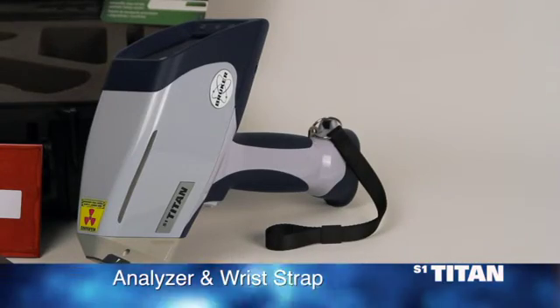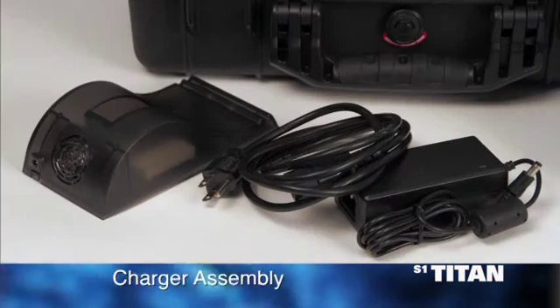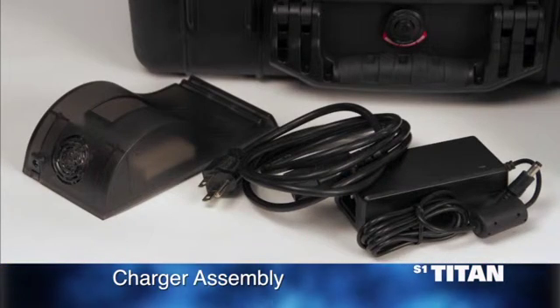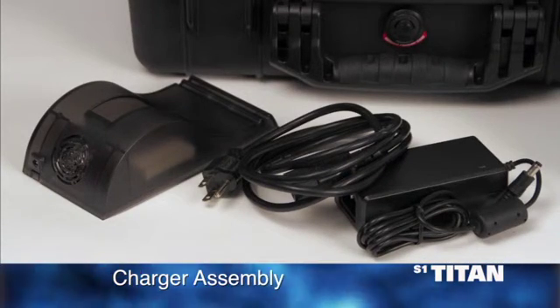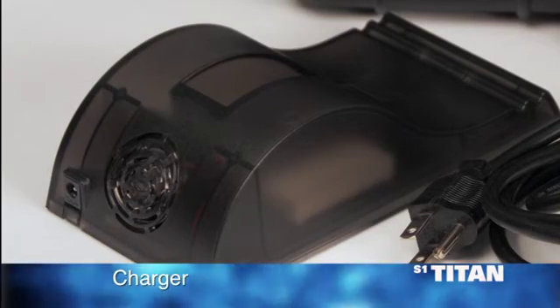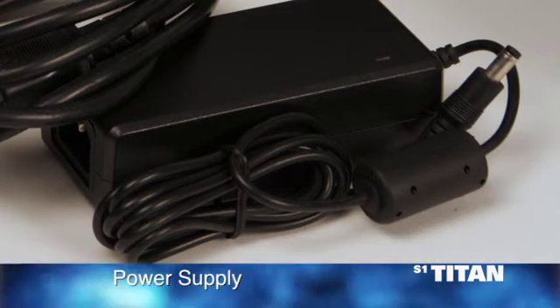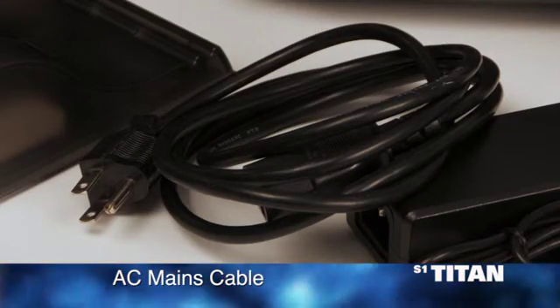The analyzer with the attached wrist strap. Two lithium-ion batteries. A lithium-ion battery charger assembly. The assembly is made up of three parts: one, the charger; two, the power supply; and three, the AC mains cable.